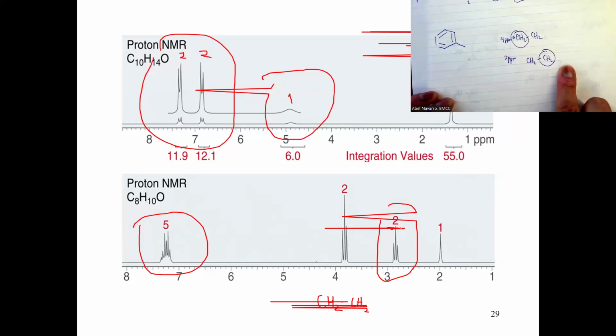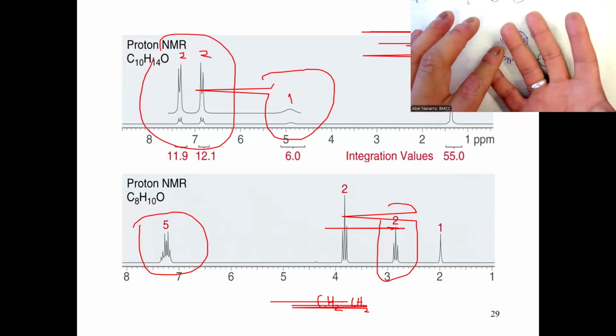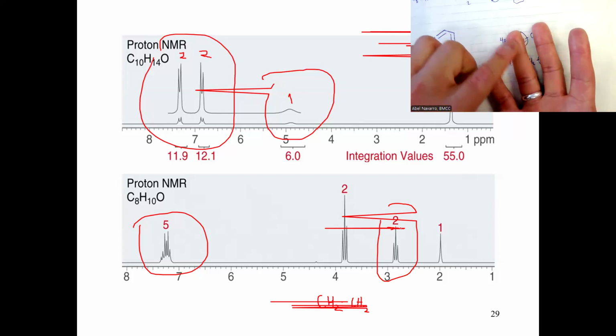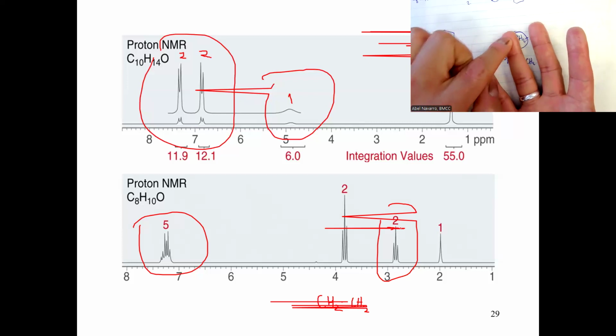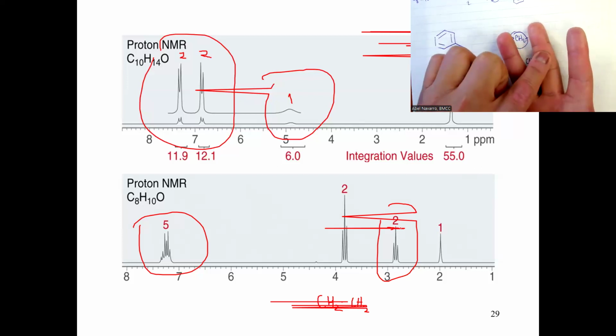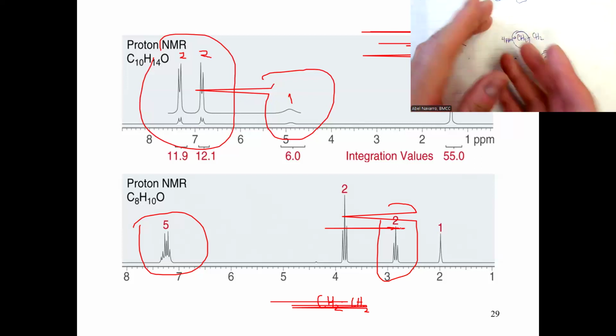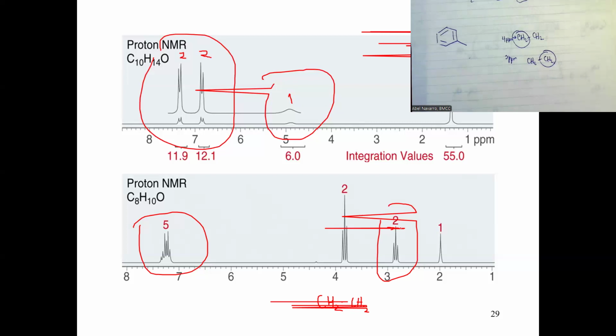So what is that telling me? It's telling me the hydrogens will talk. This CH2 will say, I am a CH2. I'm the ring finger. I'm next to the middle finger. And the middle finger will say the same thing. I'm a CH2. I'm next to the ring finger. So they will really be reporting on each neighbor. I'm your neighbor, you're my neighbor, right? So it's the same response.